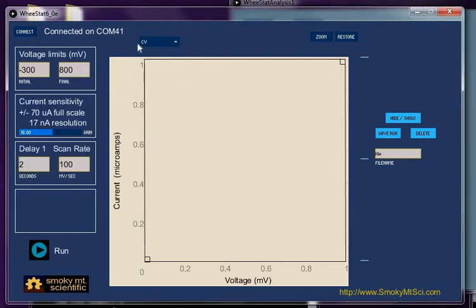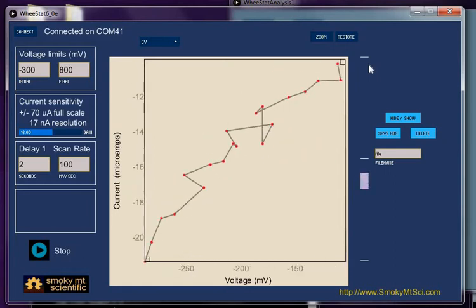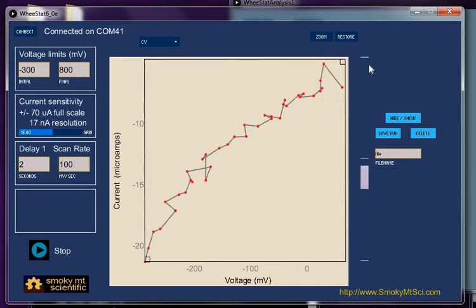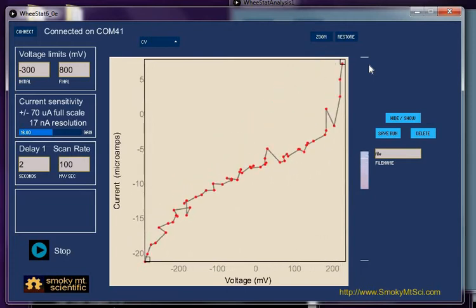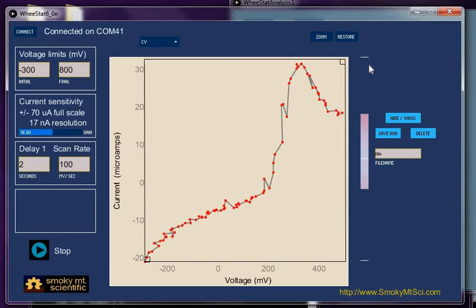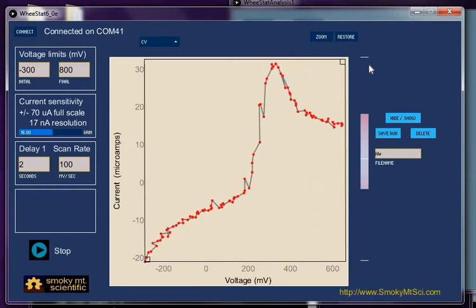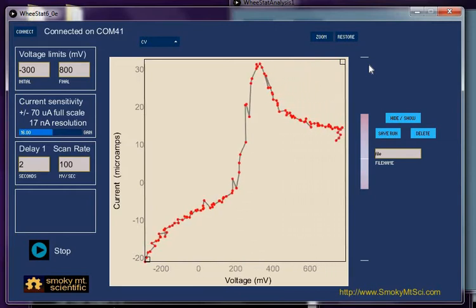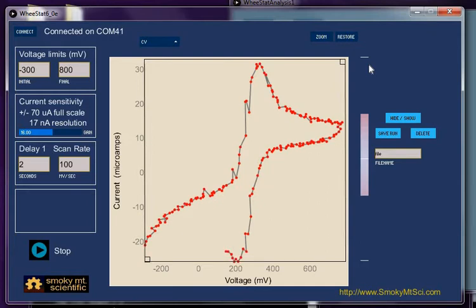Just collecting some quick data here, we're going to run a cyclic voltammogram and our sample includes some hexacyanoferrate. We got some kind of ugly data coming but it's just because my electrodes are kind of junk at this point. If you have nice electrodes you'll get better voltammograms. So there's one voltammogram.